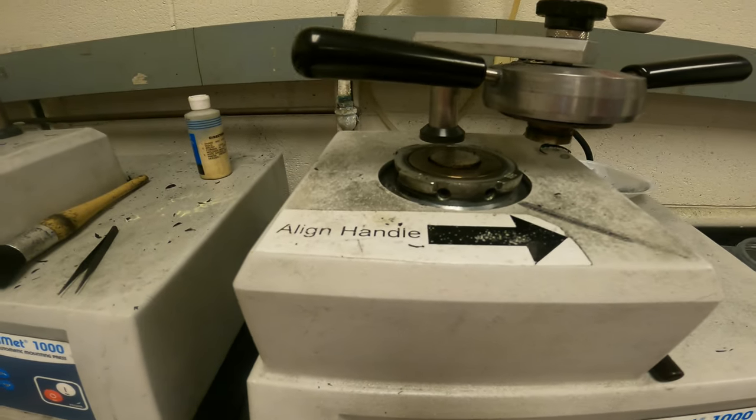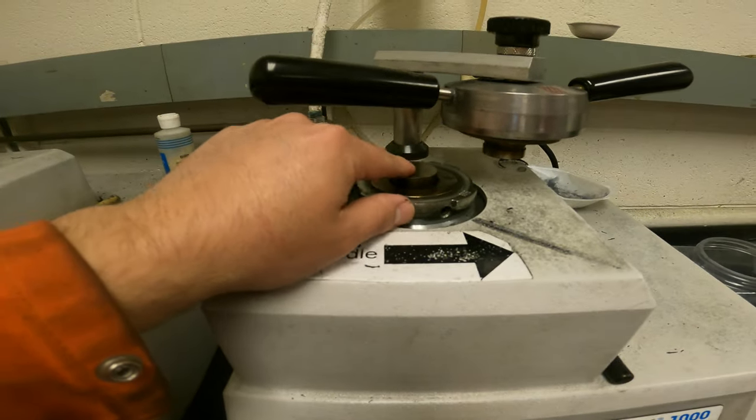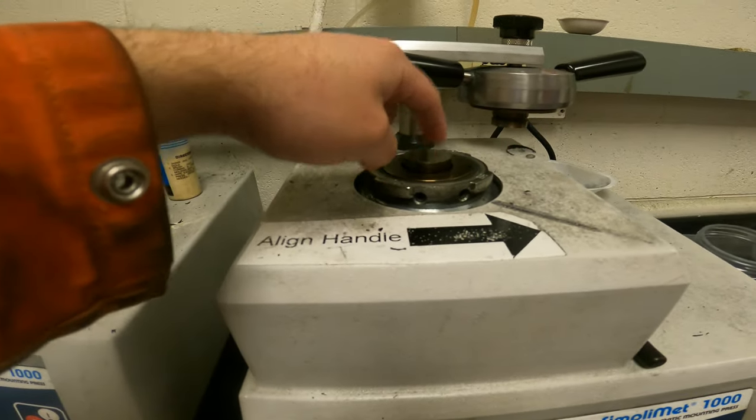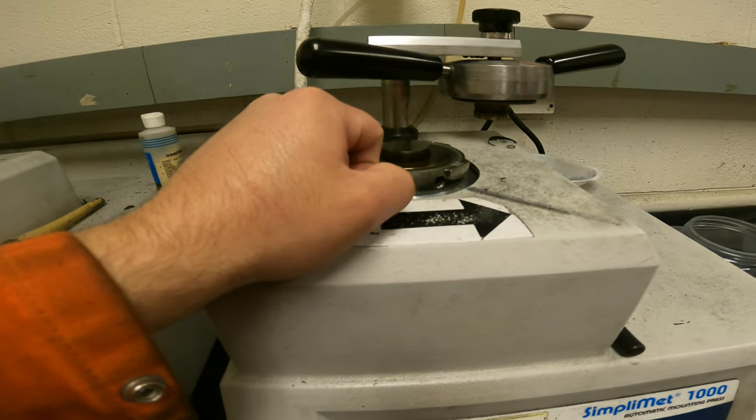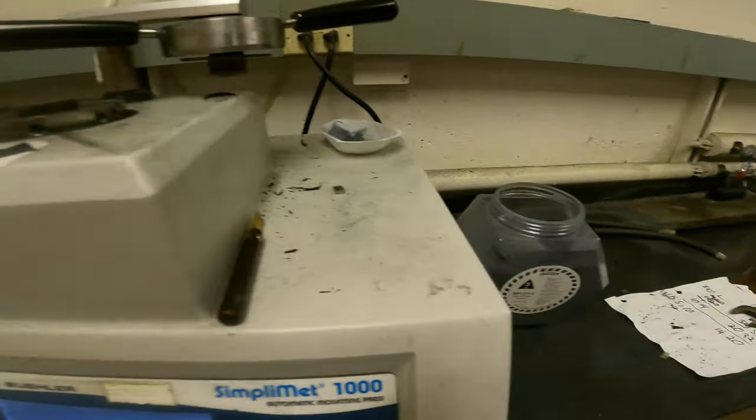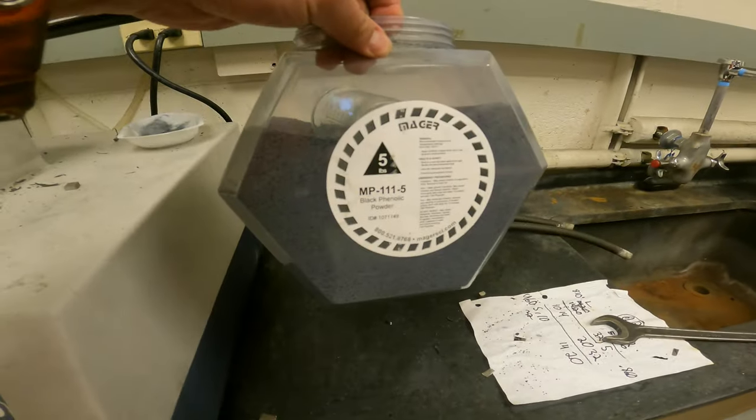So in this station is where we're going to place our sample. Obviously, the face that we want to polish needs to be down, touching the base metal here. And we're going to use these powders, which are the regular bakelite.